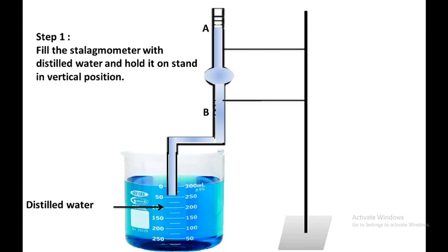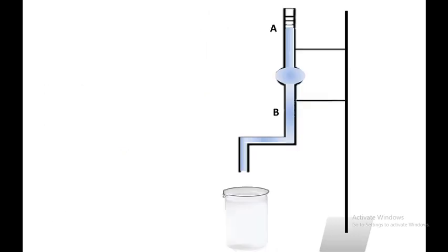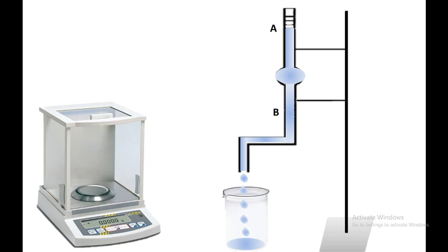Hold the stalagmometer in a vertical position and hold the liquid using your thumb, then release the thumb. Drops of water will form at the bottom of the stalagmometer. Collect a fixed number of drops — for example, 20 drops of water — in a dry and clean glass beaker. Measure the weight of the collected drops; it is showing 25.287 grams.